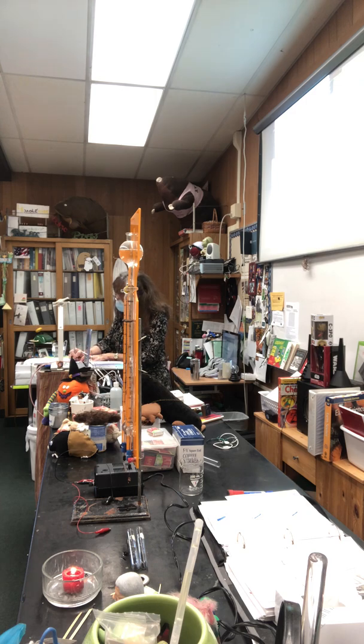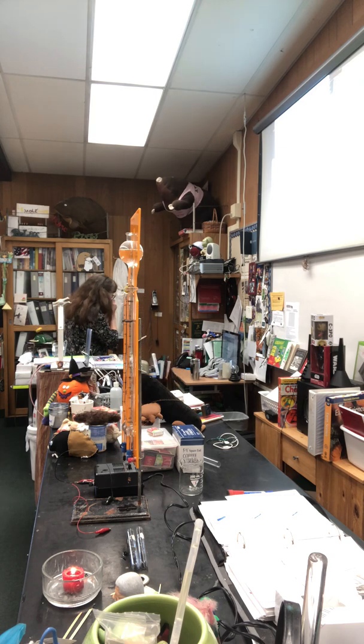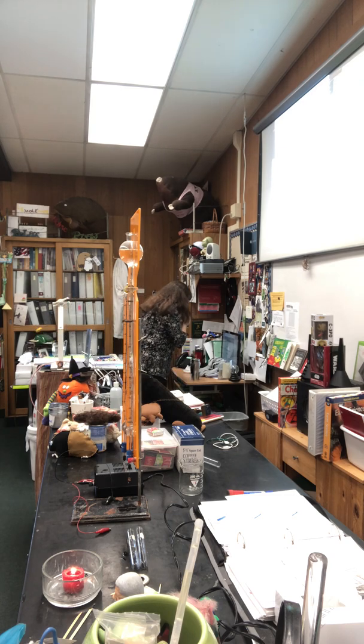Now, electrons don't care what color the lines are. However, by tradition, some of you know this from working with a car battery, the positive terminal is traditionally made red. It doesn't have to be, but that's by tradition, and the negative terminal is black. So when you're trying to jumpstart your cars, keep that in mind.